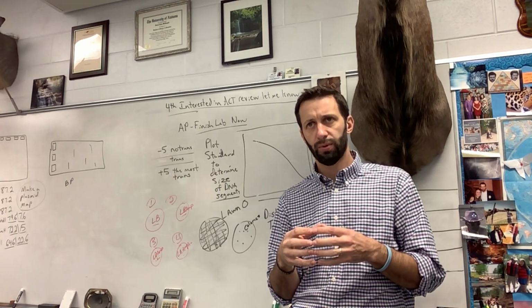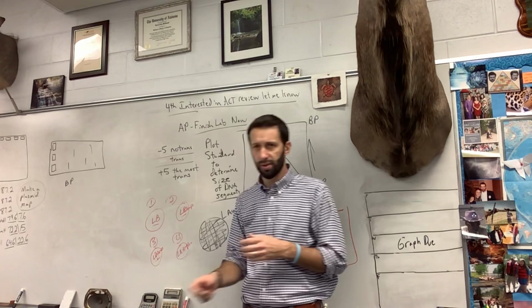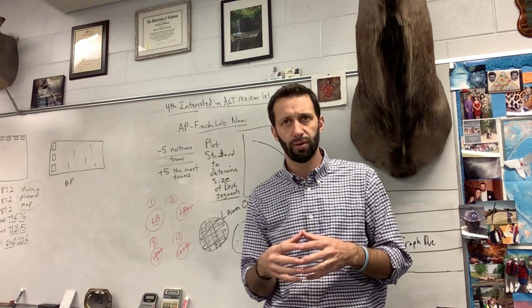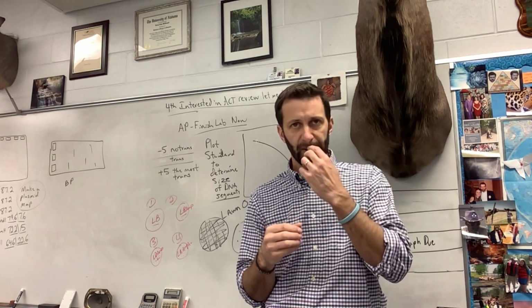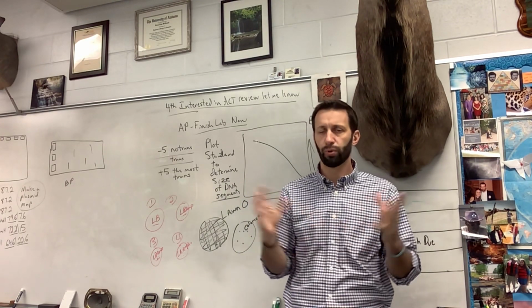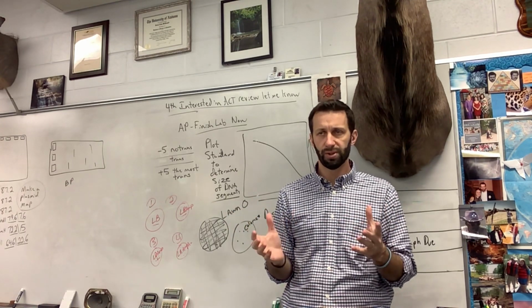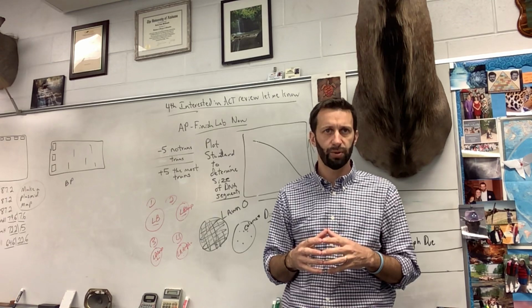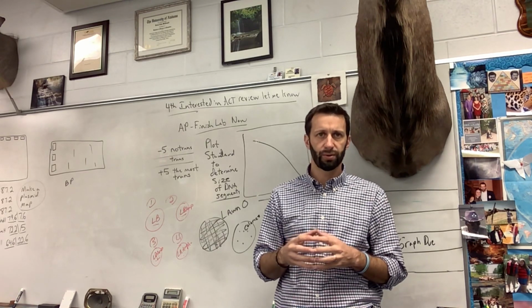So in order for them to grow on this plate that has ampicillin on it, which normally kills bacteria, those bacteria would have to take in the plasmid. Transformation rates aren't super great. Some are going to do it, but probably a small percentage of the bacteria you actually expose to it. So you are probably right that you would expect to see colonies growing on that.